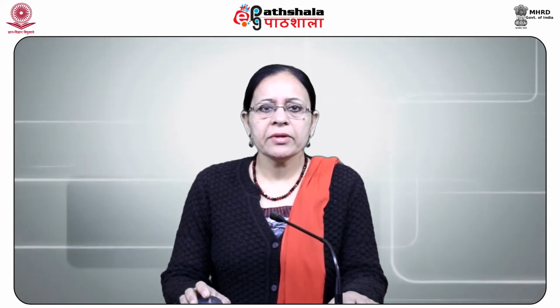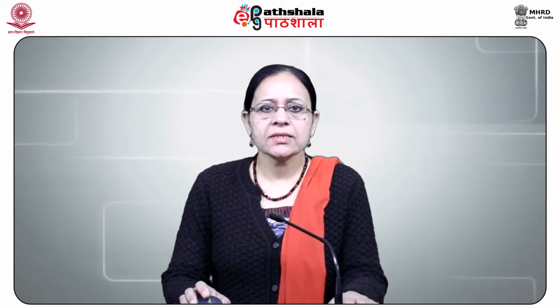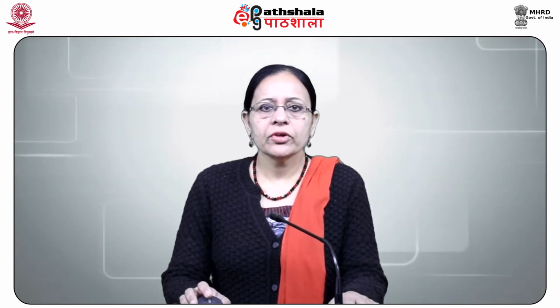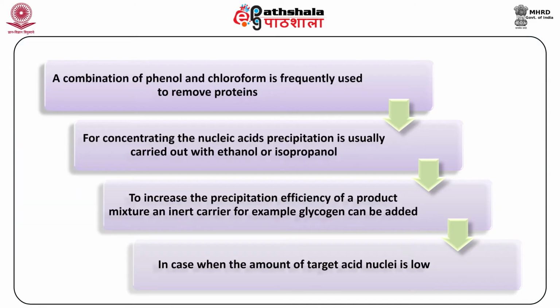To remove contaminants from the nucleic acids, the frequently used method is solvent extraction. For example, a combination of phenol and chloroform is frequently used to remove proteins. For concentrating the nucleic acids, precipitation is usually carried out with ethanol or isopropanol. To increase the precipitation efficiency of a product mixture, an inert carrier, for example glycogen, can be added.